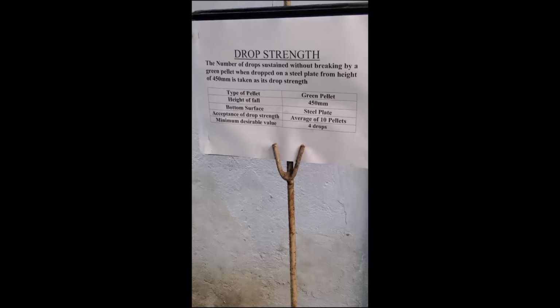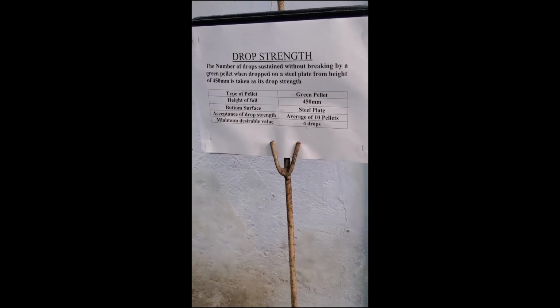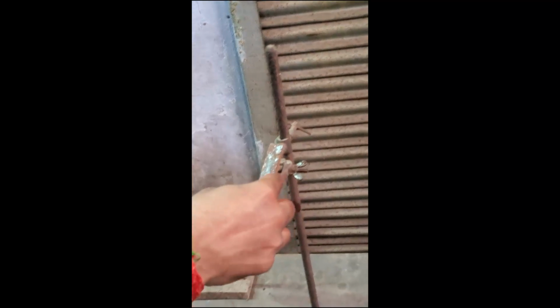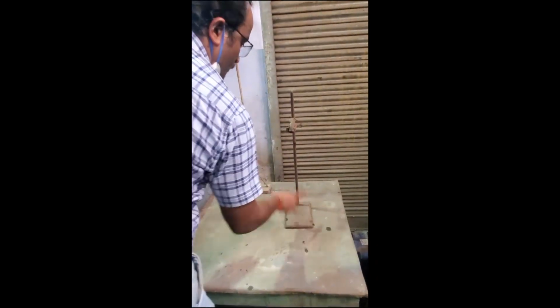Now we are measuring the drop strength of these green pellets. These green pellets have iron ore and only water. 12% water is there. So this is the setup. This is the simple setup. See, this is the platform where we will keep this pellet. From this height it will fall. The height is 450 mm.